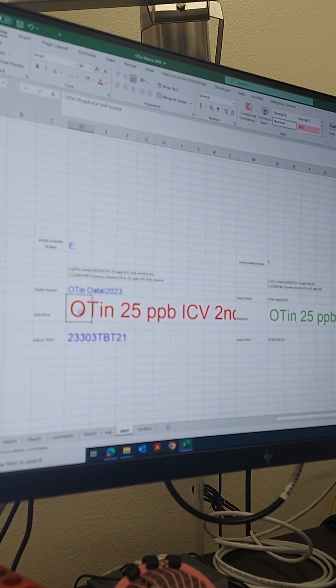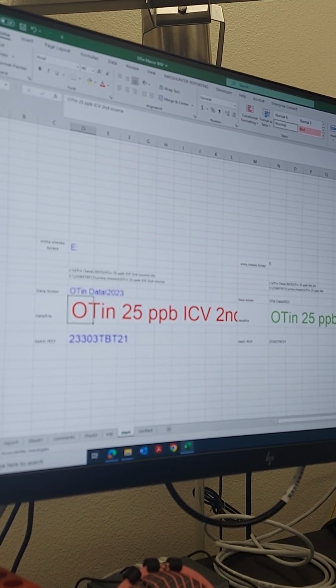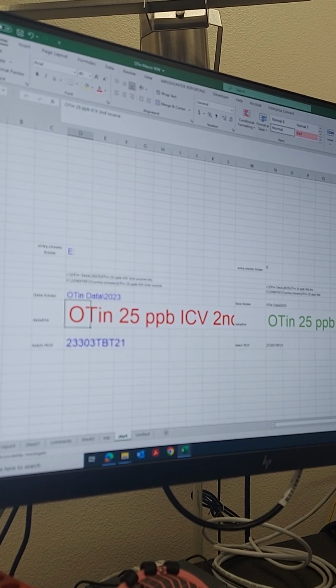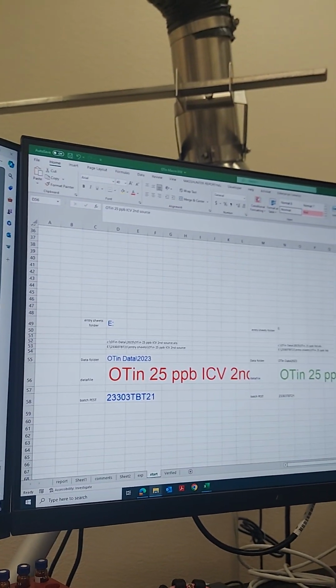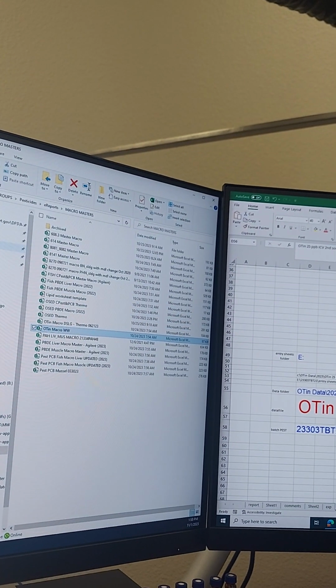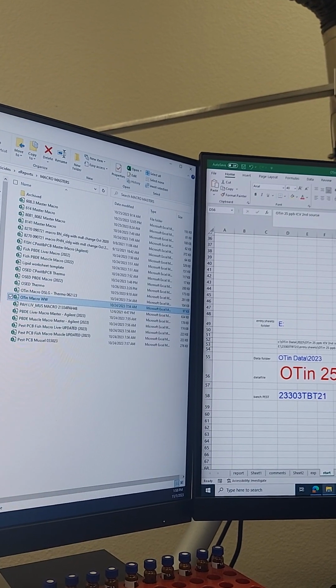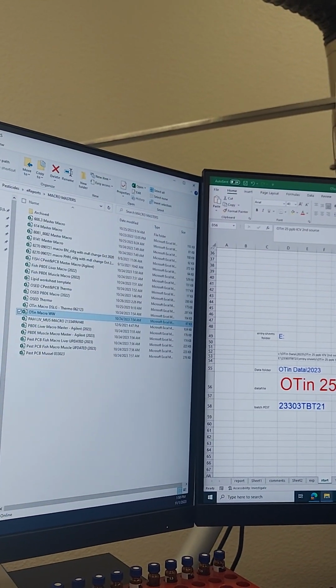But for any samples, let's go back to our samples. Where is that? Our samples are C drive, right? Yeah, it's here.